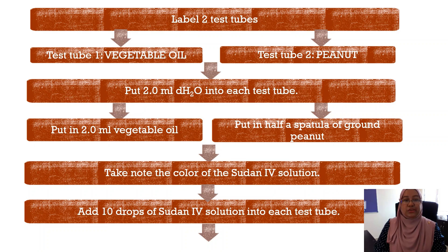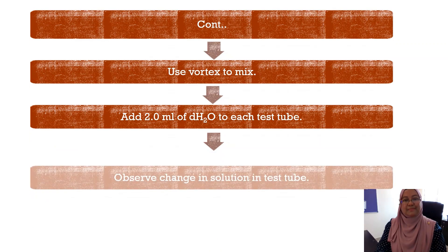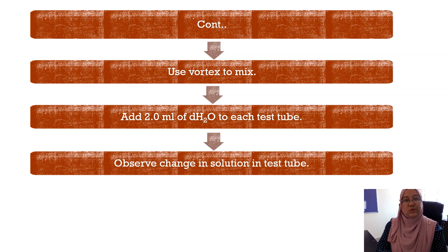This is the final procedure to determine the presence of lipid. Label two test tubes: test tube one for vegetable oil, test tube two for peanut. Place 2 ml of water into both test tubes. In test tube one, put in 2 ml of vegetable oil; in test tube two, put in half a spatula of ground peanut. Take note of the color of the Sudan IV solution, then add 10 drops of Sudan IV solution into each test tube. Mix both test tubes using a vortex mixer, then add 2 ml of water to each test tube and observe any changes that occur.